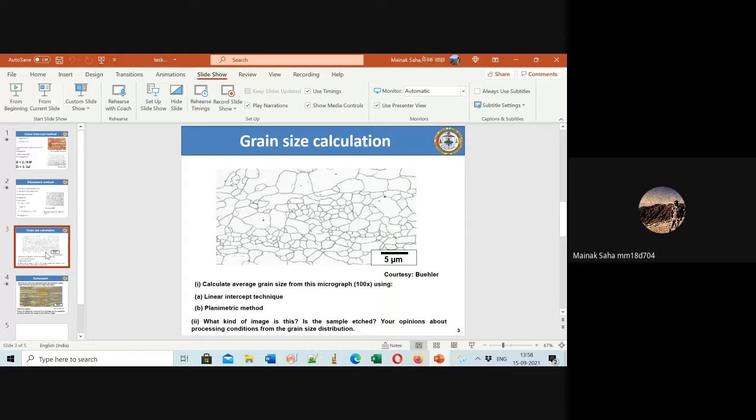Sir, for the value of D, I am getting 2.25. Okay, small d, na? Small d is 1.5. Oh, okay. So you got 2.25. Okay, still that is comparable with the 3 microns and 2.25. Still it is near about okay.